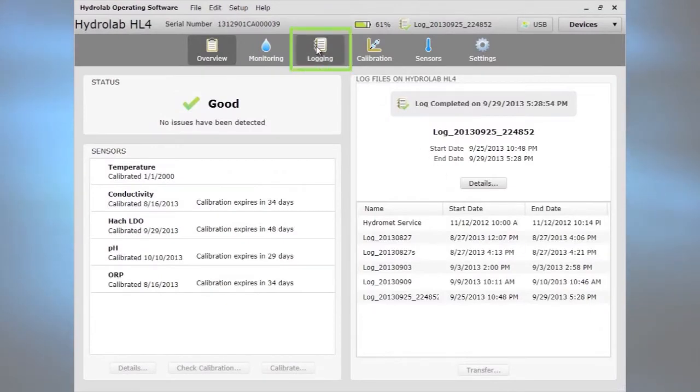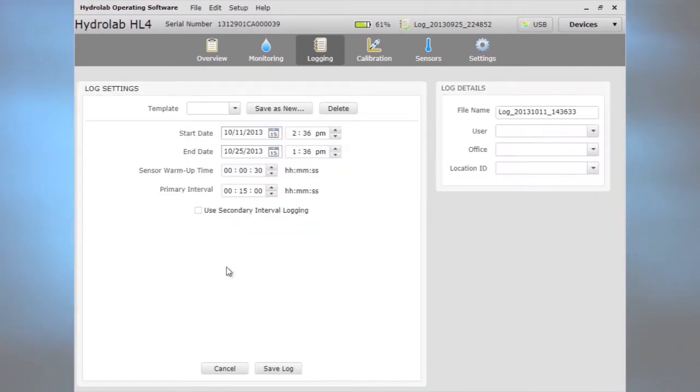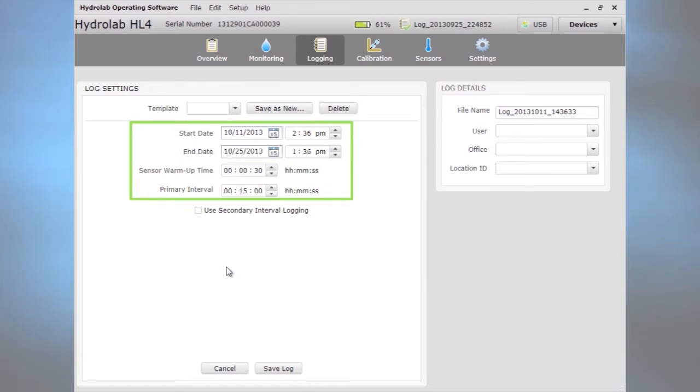For unattended use, click logging to create a new log. Choose the start time, end time, warm-up time, and primary interval.